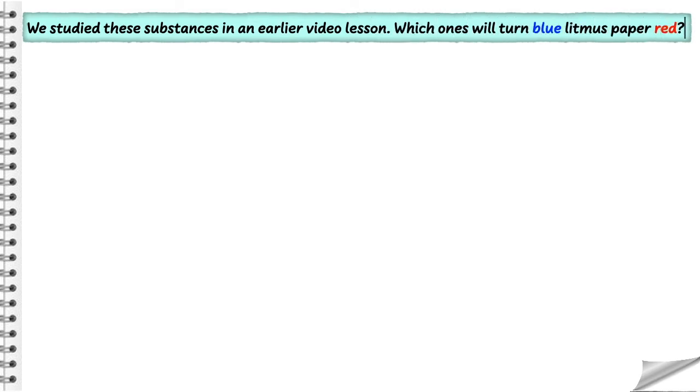We studied these substances in an earlier video lesson. Which ones will turn blue litmus paper red?